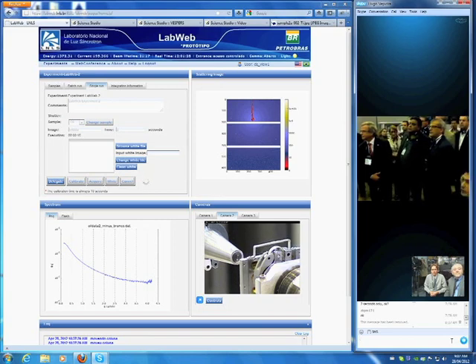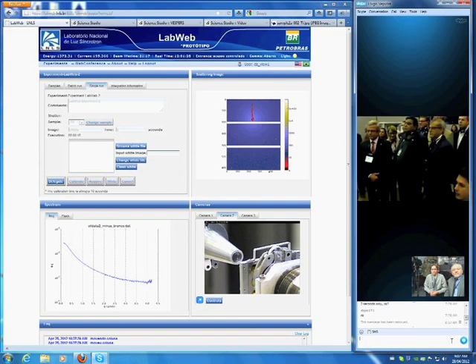Now, start the position of the measurement. Okay. This is a sample, okay? We are ready? Yes. Just the name of the file. Okay. And just where we will get the position. Second. Okay. Just click and do. Okay. So the red light turns continuously. It means that we have that.